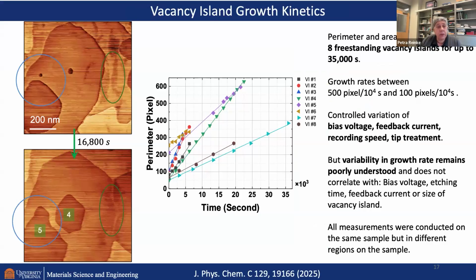Here you can see the line defect again and how the recession worked, and you can see these corners which are pinned at that line defect. So any inhomogeneities on the surface influence your etch rate and how your etching progresses. This is good and bad. Good is if you can introduce them intentionally, because this will allow you deterministic etching. The bad thing is if you have inhomogeneities in your sample, that then also controls to some degree your etching.